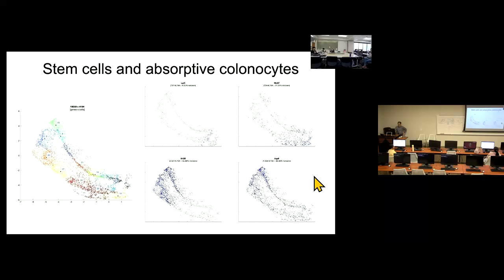My initial thinking when I first started all this single cell stuff was that we'd be able to have our cell atlas with all our gene markers and cell types and just kind of click and play and it'll identify stuff for us. I learned over a year or two that that is not possible at the time, especially not for this particular cell type. It works actually pretty well for things that separate out really nicely, like blood cells, like peripheral blood mononuclear cells. Those do separate really nicely into T cells, B cells, NK cells, and I can actually identify them using a cell atlas. But for the colon, I just haven't been able to do that.